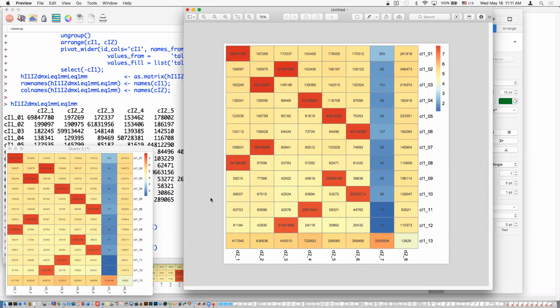We're only seeing this because we ran a dual design with a lot of empty squares. But this is happening all the time, right? If I had run this library as single index, do you think the hopping would magically go away? No, we just can't observe it, right? If I ran this lane as single index, what does that mean?